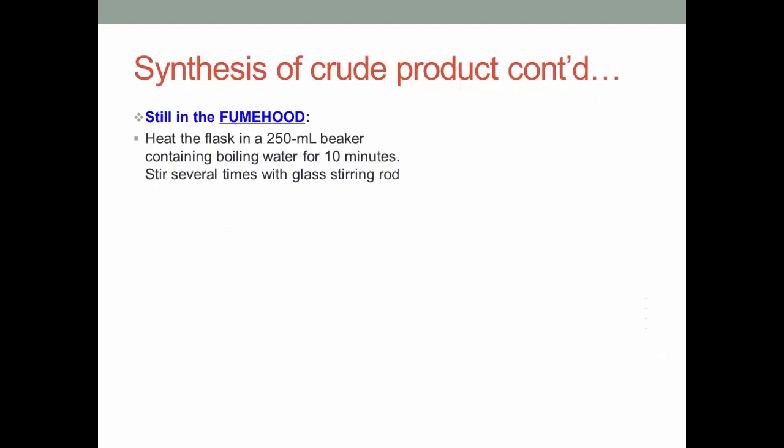Staying in the fume hood, heat the flask in a 250 ml beaker containing boiling water for 10 minutes. Stir several times with a glass stirring rod. Then, remove the flask from the boiling water and add approximately 30 ml of ice water to decompose the excess acetic anhydride.